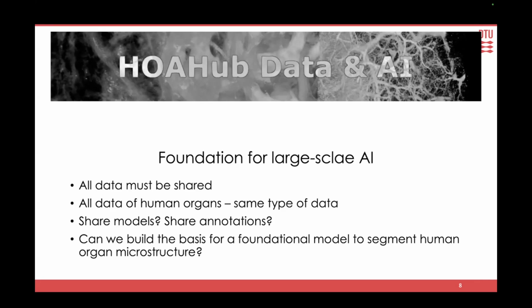It gives really large images and great detail of great complexity, and also a kind of data that we are not so used to working with. And then we have the requirement that data should be shared. It's not as constrained as CT scans of the human body, but nevertheless, it's not just any type of data. It is actually HiP-CT data that's collected. So it's the same type of structures, you could say, so there's some constraint on what is possible to see and what's not.